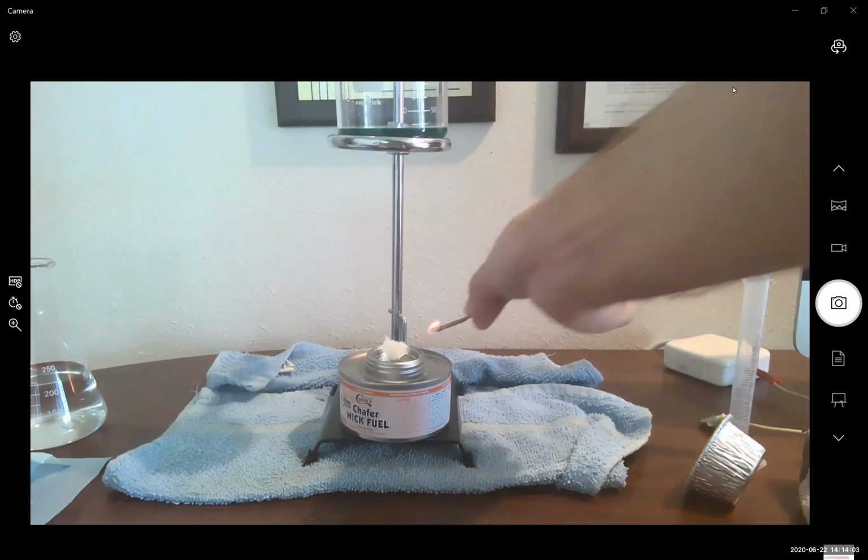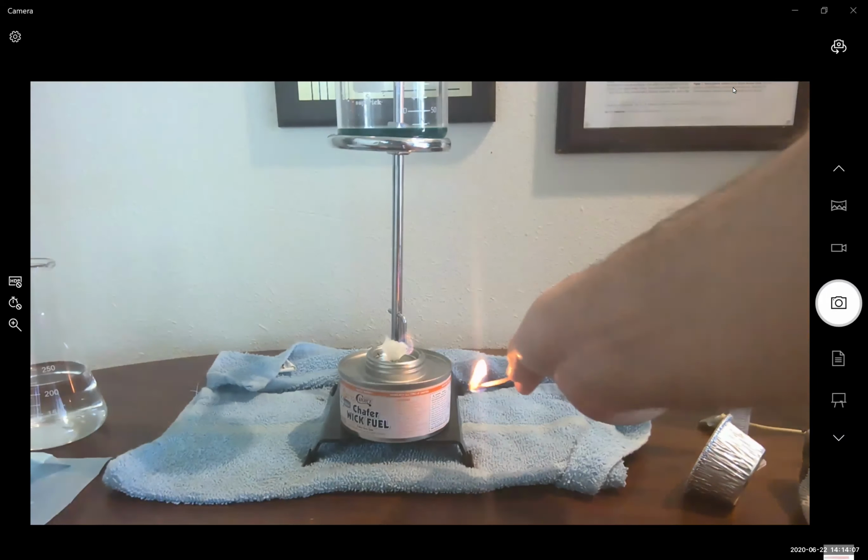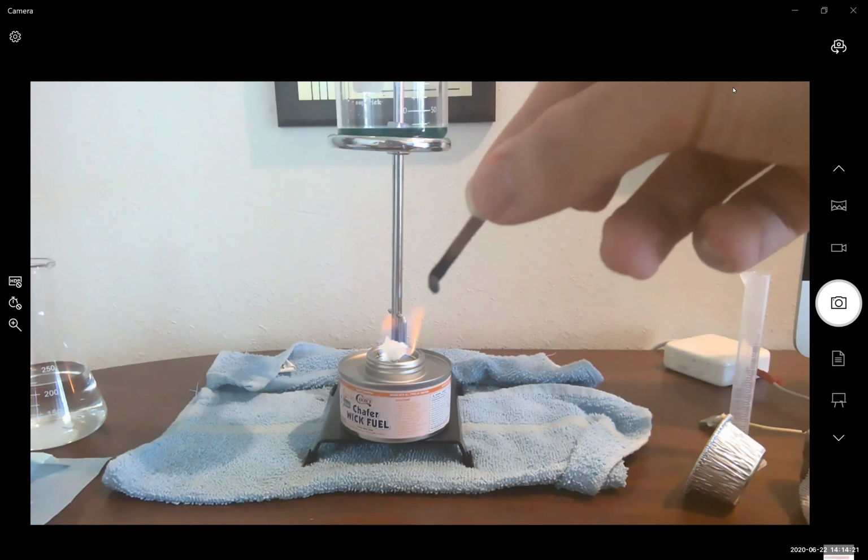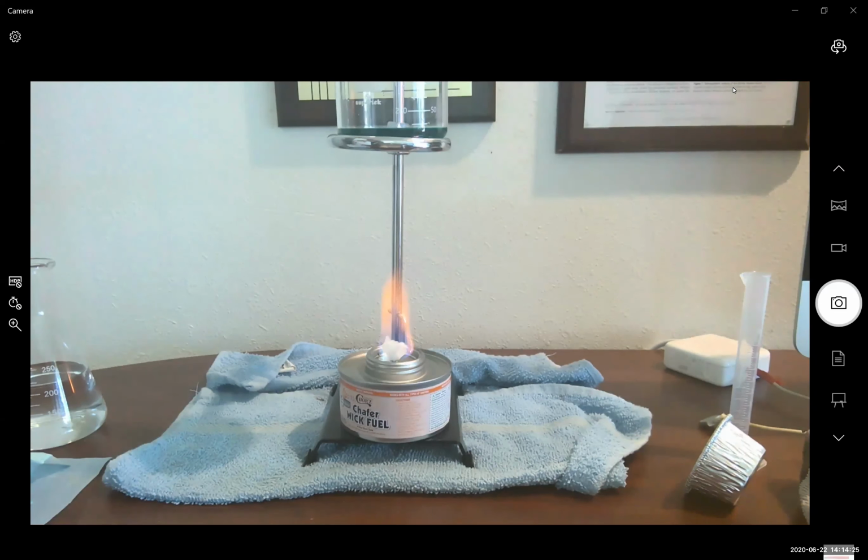Okay, so what we're going to do is light our sterno wick, making sure that our match is completely out in this process. Okay, now we're going to store the match, put our matches away, and continue the heating process. First and foremost, now that we have lit our sterno contents, the flame will light up immediately.